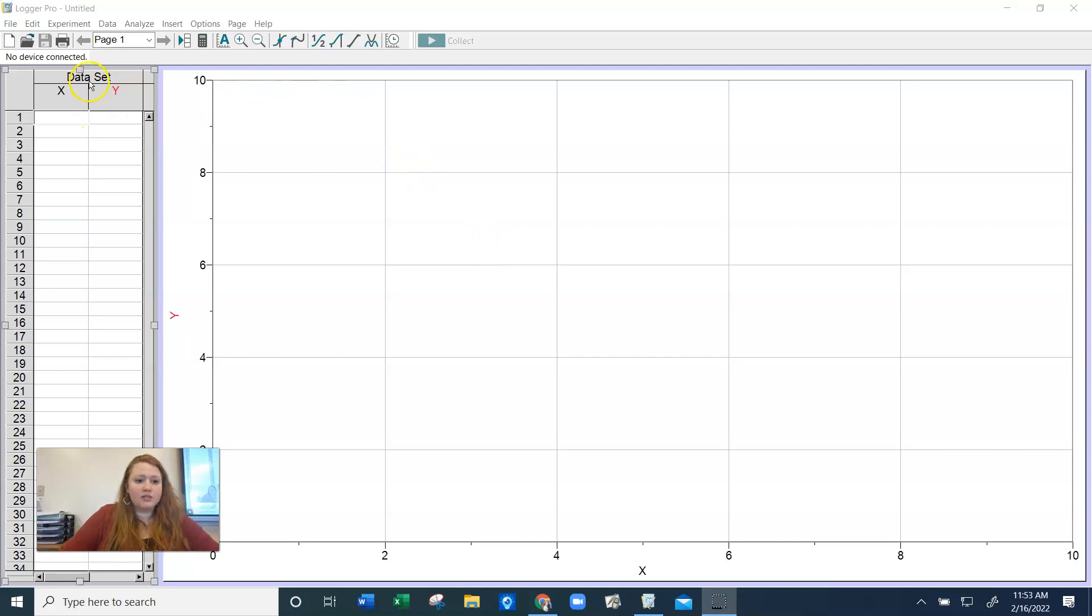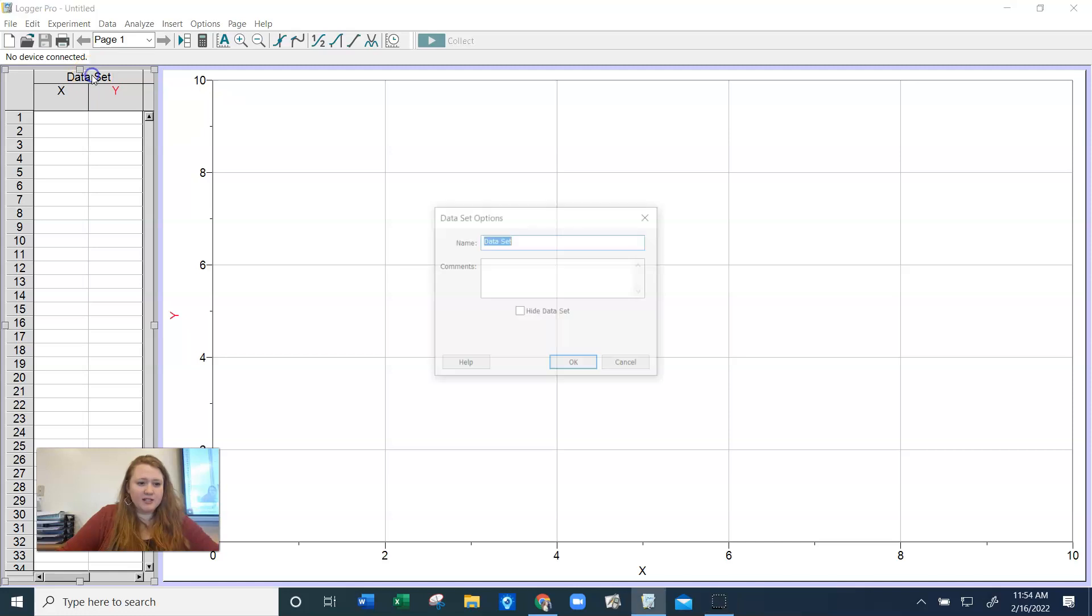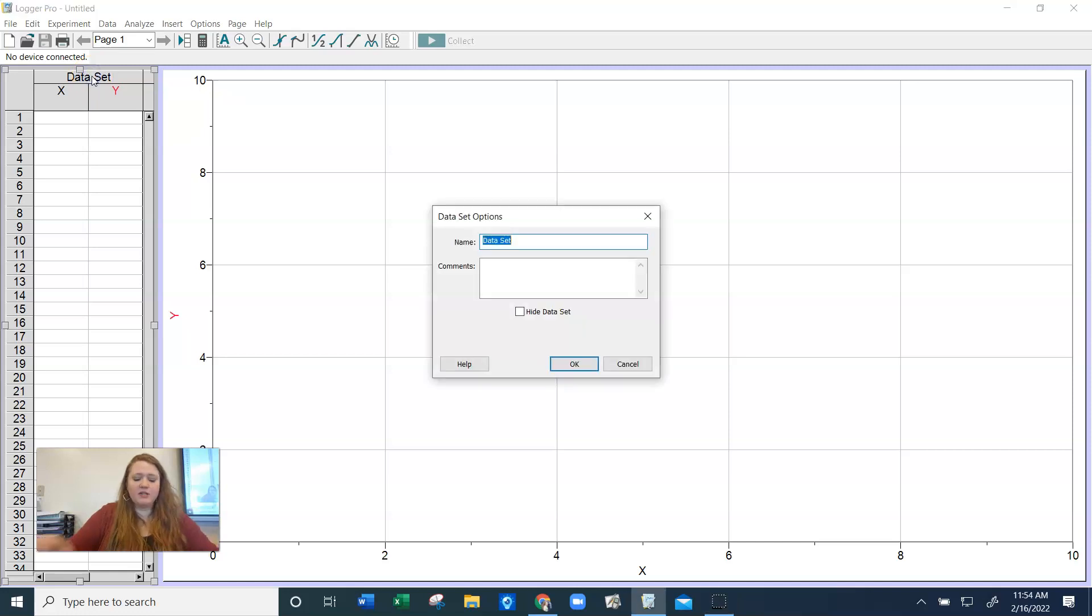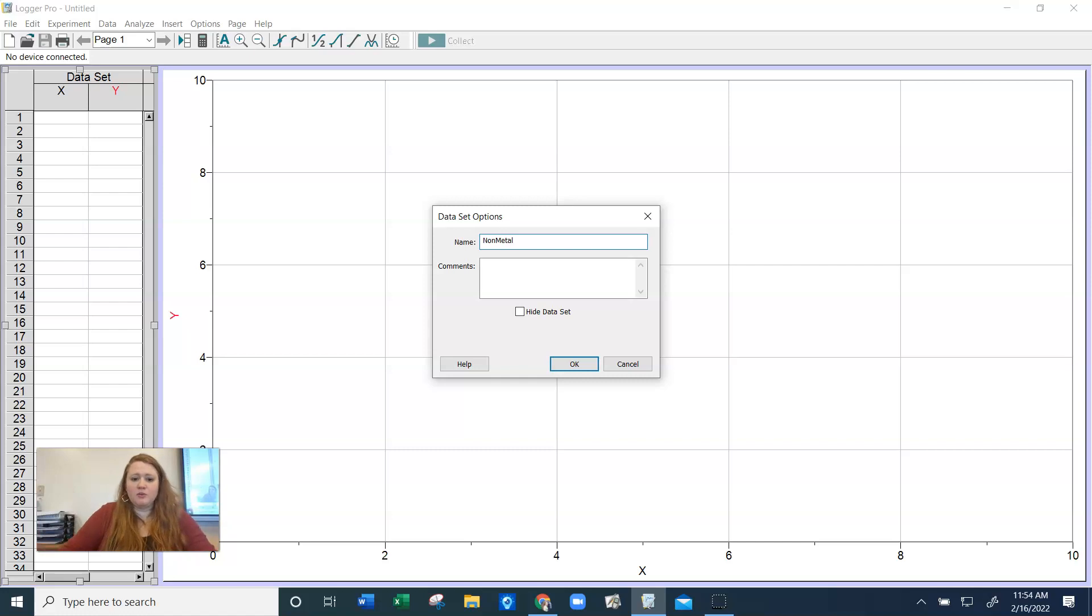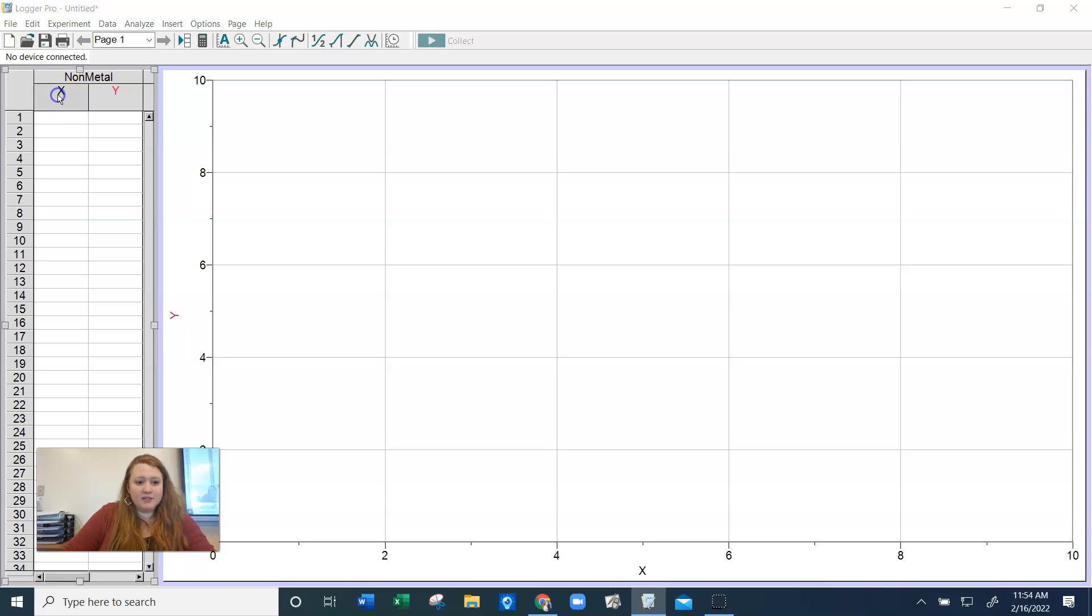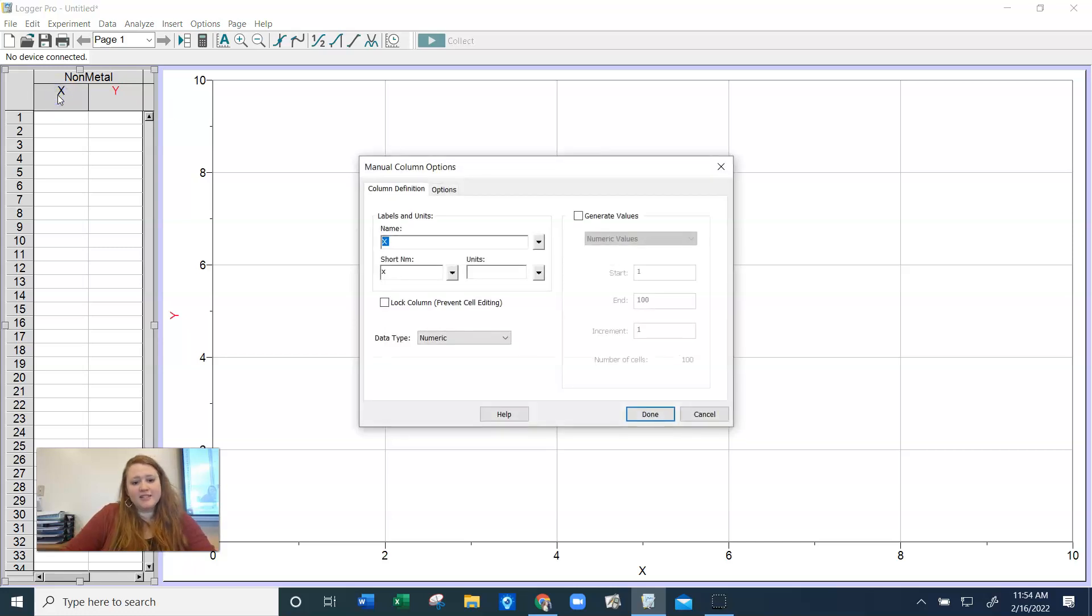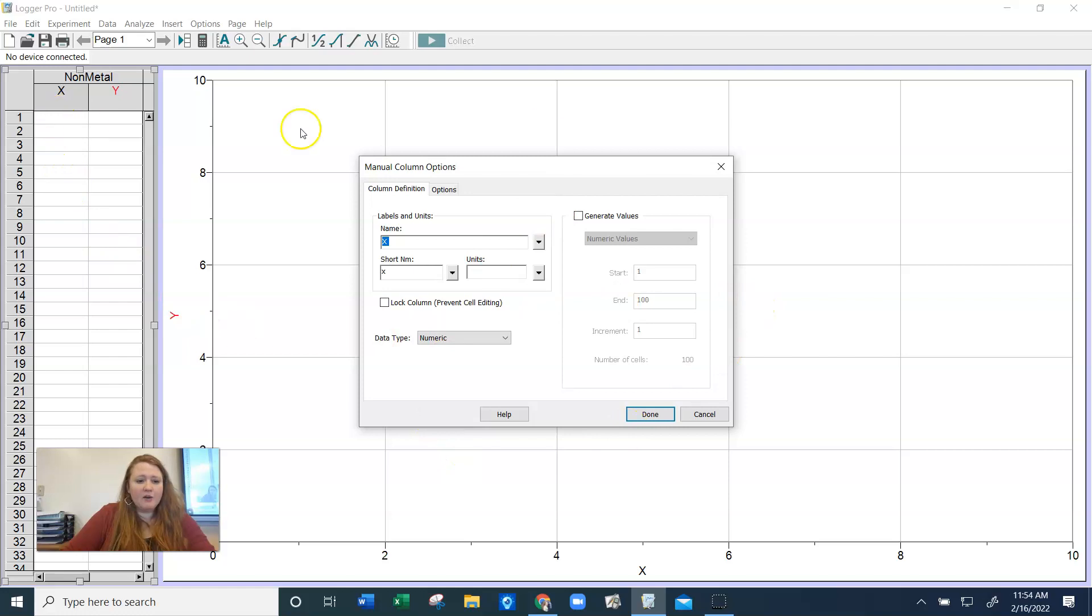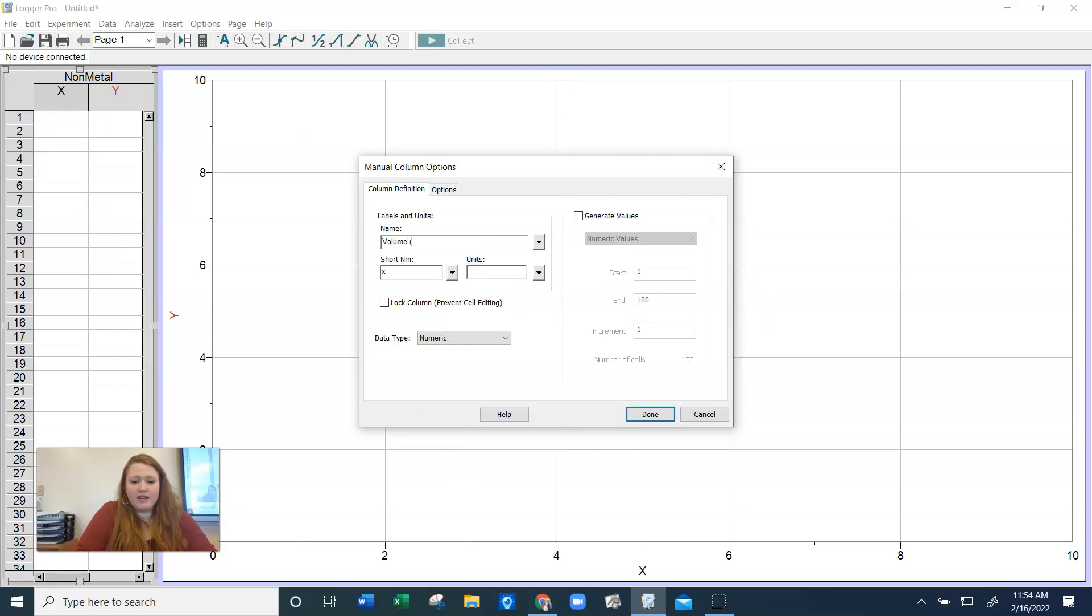Now, today we worked with a metal and a non-metal. So our first data set, we will name the non-metal. I want to type it in there as non-metal. That's our first data set. And then for our x-axis, I'm double clicking here to open up these boxes. Our x-axis is volume in milliliters.